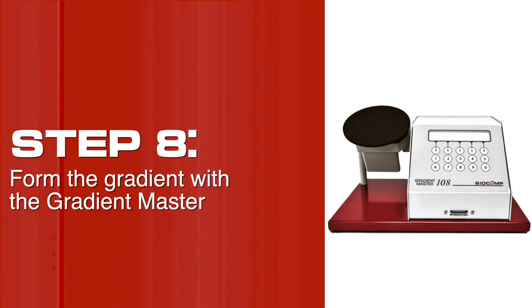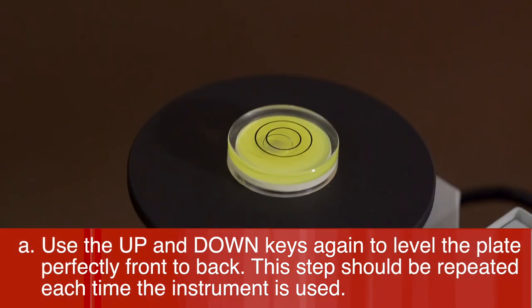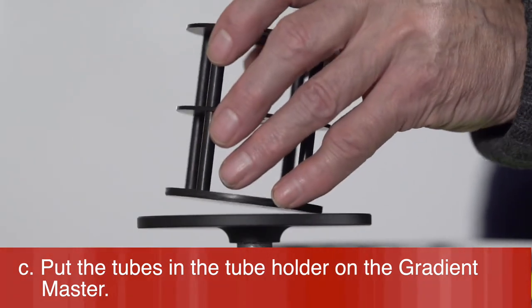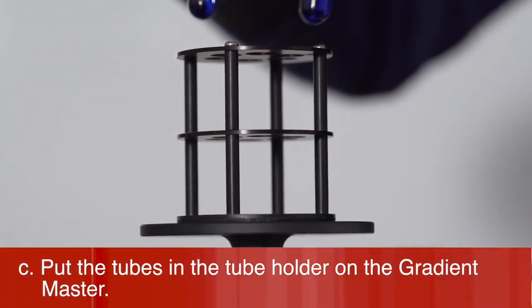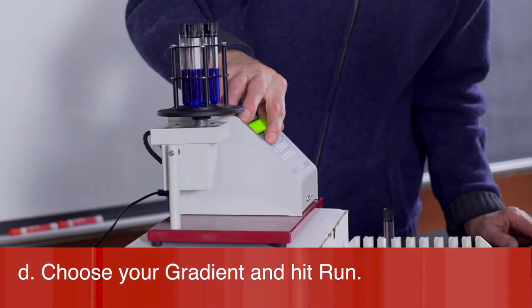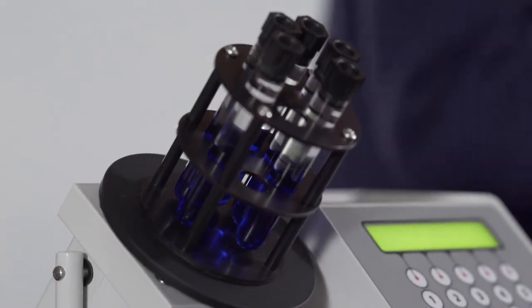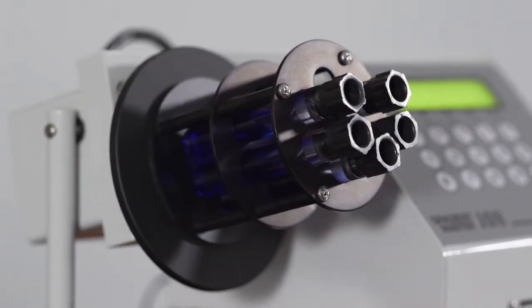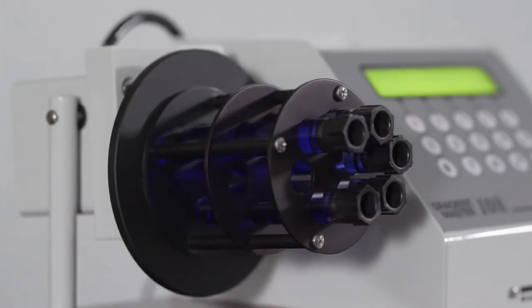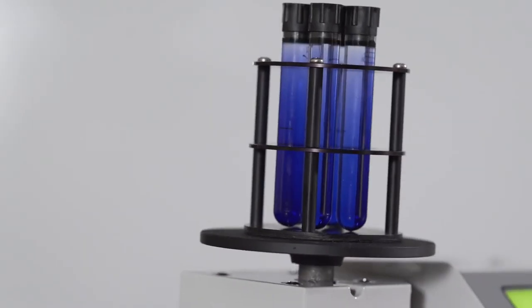Step 8: Form the gradient with the Gradient Master. Use the up and down keys to level the plate perfectly front to back — this step should be repeated each time the instrument is used. Hit the done key; the Gradient Master is now ready for use. Put the tubes in the tube holder on the Gradient Master, choose your gradient, and hit run.